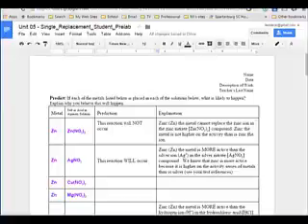Okay? Let's look at the second one here. In the second one, we are comparing zinc and silver nitrate. So if zinc by itself, zinc the metal, is put in a solution of silver nitrate, will a reaction occur? Let's go over to the activity series.